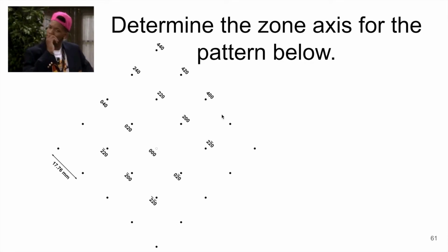They're all zeros in those cases. So that's one hint here. And then if you look at all these HKL values, if you apply the Weiss zone law and all these observable HKL values, you'll see that the 0, 0, 1 fits that expression.